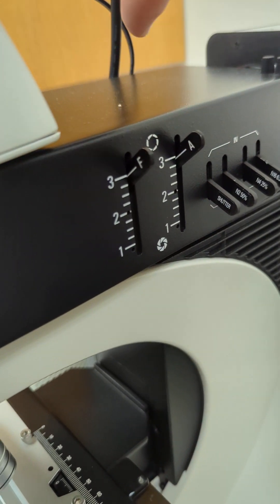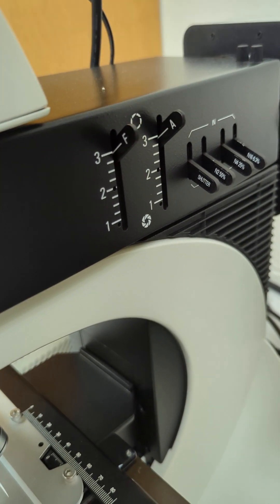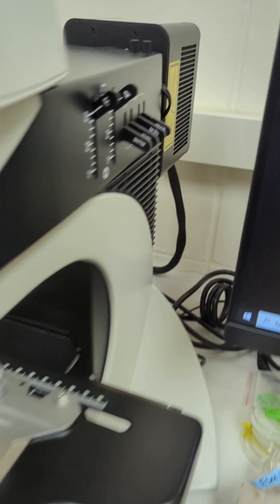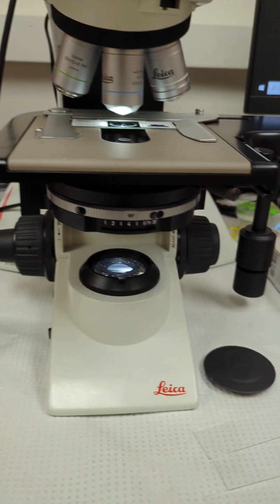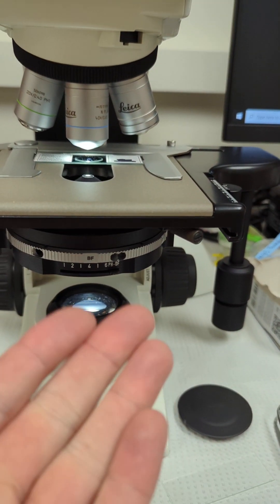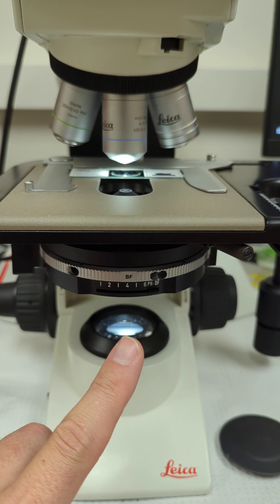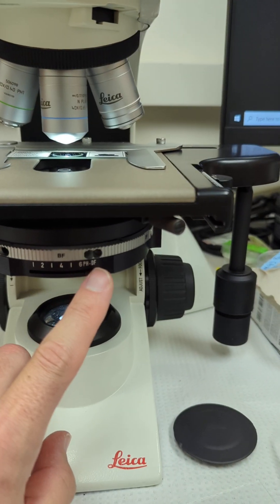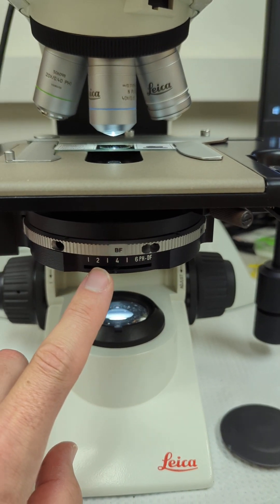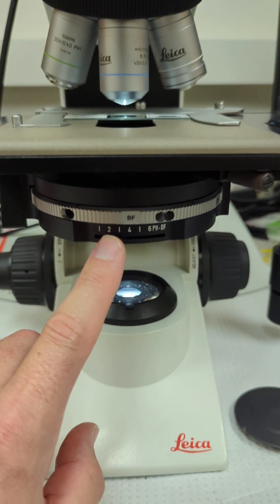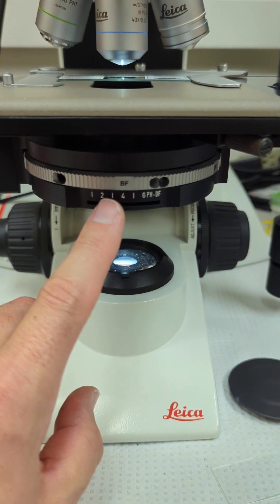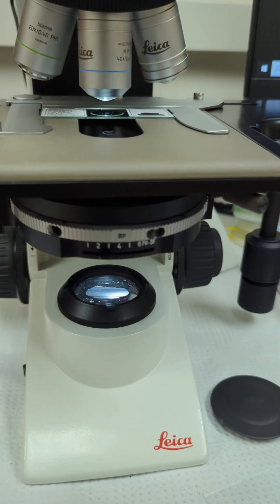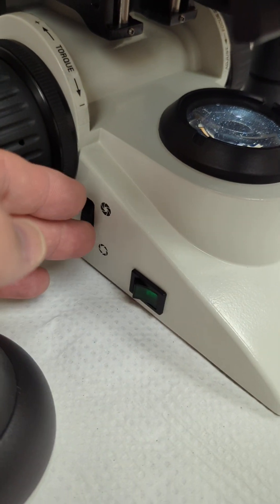These are your apertures: field diaphragm and your aperture diaphragm. They're exactly the same as these here in transmitted light coming up from the bottom. This here is your aperture diaphragm, and this here is your field diaphragm for transmitted light. These are for reflected light.